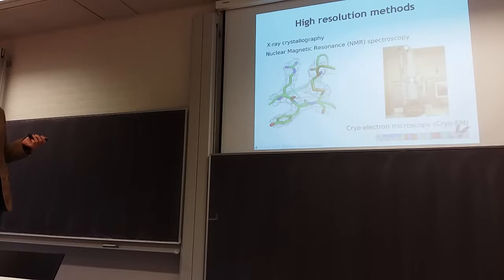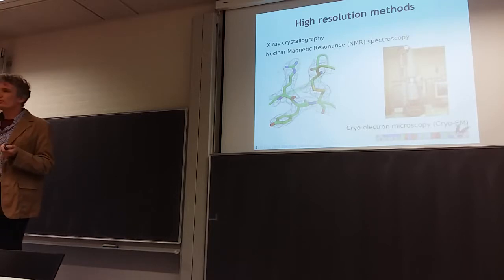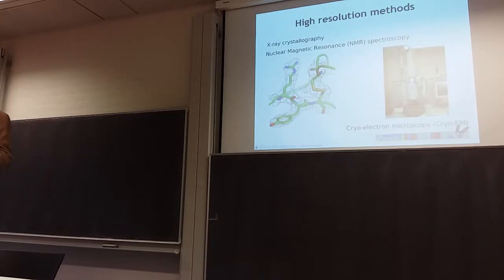The really cool thing about cryo-EM is that it's actually microscopy. You literally zoom in on a molecule. You can't really zoom in and see the atoms, that's not how it works. But you can image multiple individual molecules and merge those images together to get higher resolution, a compound image.